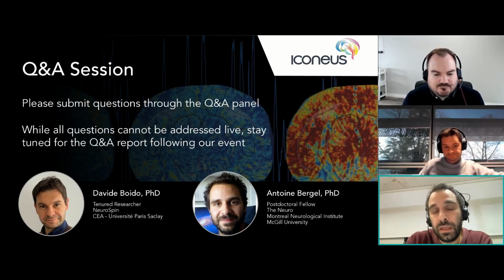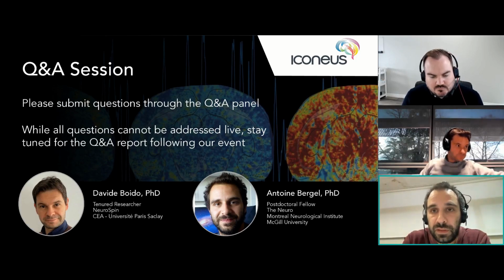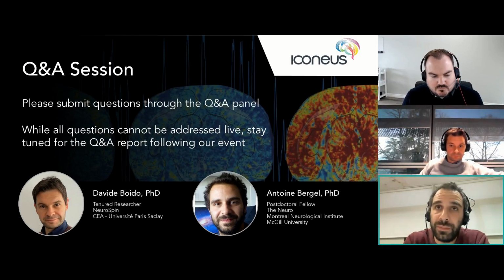So I'm a big defender of this craniotomy approach because we invested a lot in improving them. And so far, when we also try to check for inflammation, we don't see obvious markers of inflammation for extended periods of time. So sure, there's also the problem of temperature that Davide mentioned, which is definitely something that could modulate brain activity.